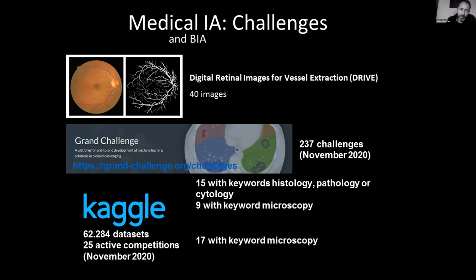Finally, I'm sure you heard about Kaggle. Kaggle is way broader. It's any kind of challenge in there. There are many datasets, 62,000 or more. But again, only very few are related to microscopy images. About 17 I could count, by filtering with keywords again.